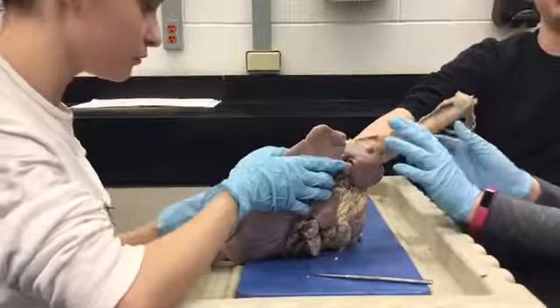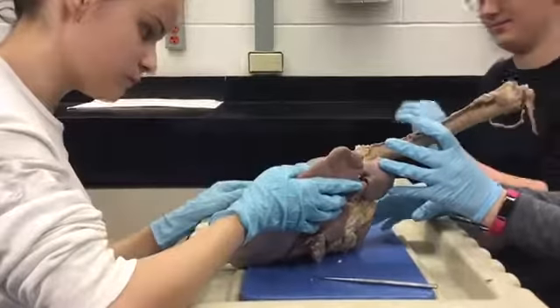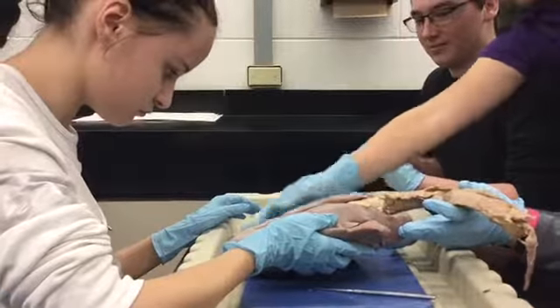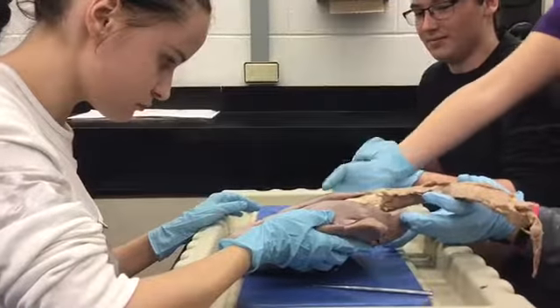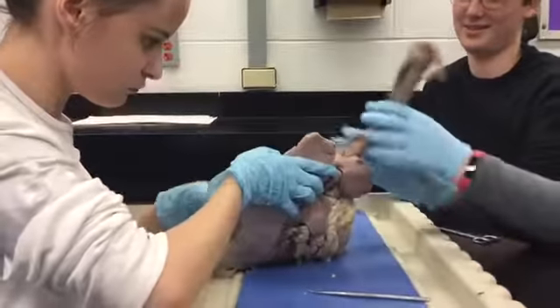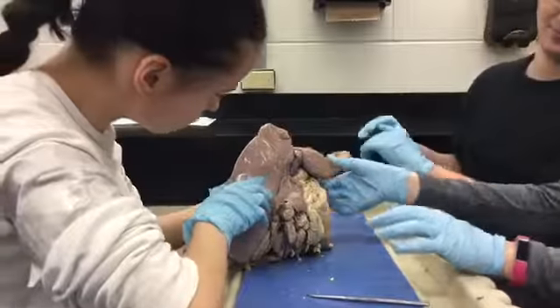Okay, so the lobes. Let's look at them. How do you tell them? I see one, and you have a slightly mouse-shaped one, and I see two. Since this is kind of mouse-shaped, I wouldn't use one like this. It'd be more obvious with three.